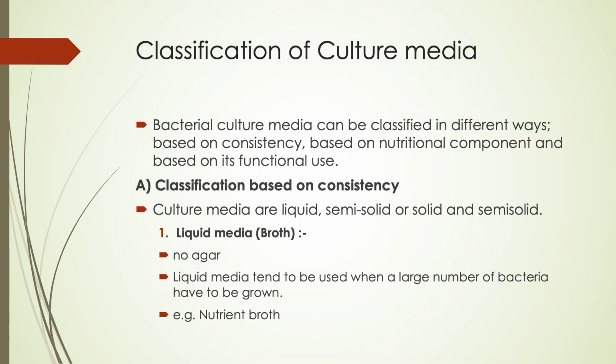Sometimes you are saying, for example, based on the functional use. As I mentioned, if you want to transport the bacteria from one place to another, for example, from one laboratory to another laboratory, how can you just transport it? So you need a transporting media. Okay, so this is the classification of the culture media.